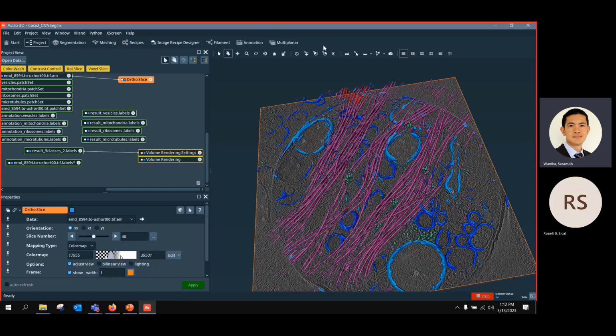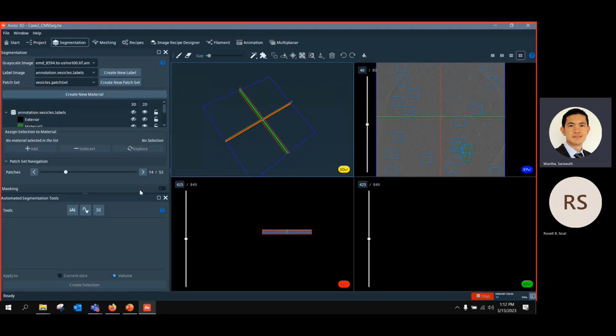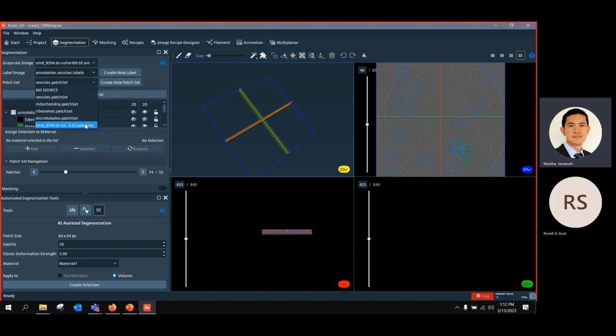You mean here? That's a good question. I didn't think about whether they already store this model somewhere. No, but what you could do is save this asset and use it for the different images, but not the model, because I'm not sure if they store the model somewhere.